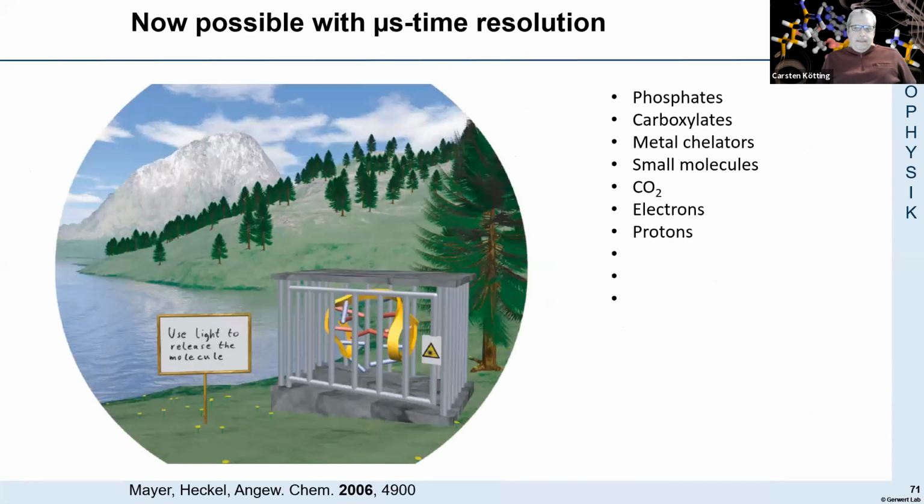Yeah, so this is the data we took in February, and obviously we want to proceed there, doing isotopic labeling again to assign what's going on on the microsecond timescale. But also, since there are so many more CAGE compounds available, there will be several other proteins we are interested in, which are now possible to investigate by single-shot experiments.